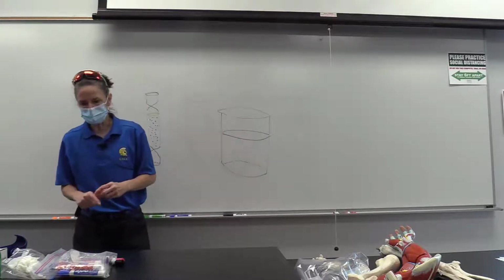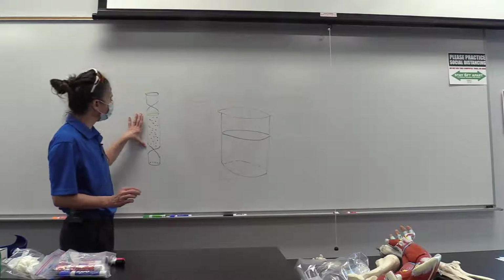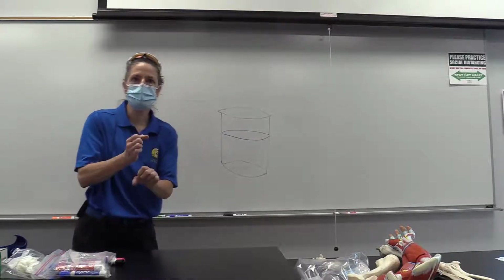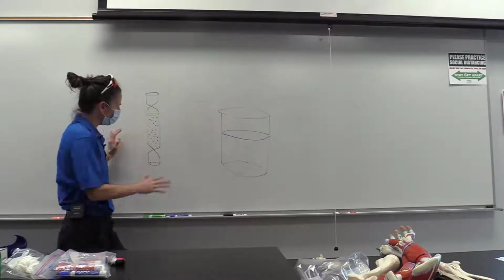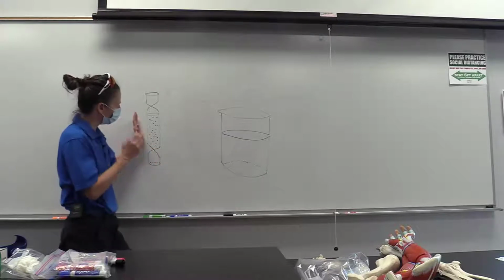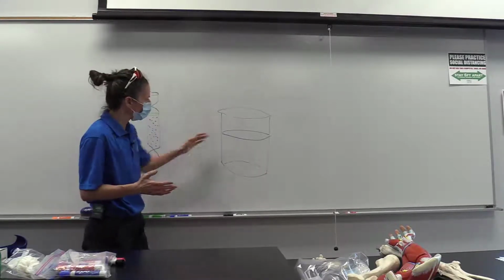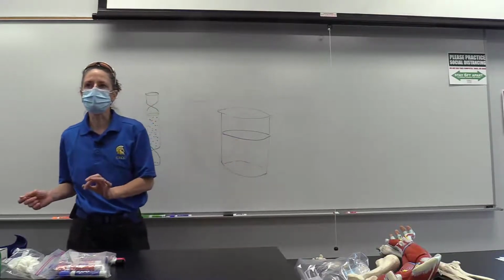And so what we did was, once we created this little dialysis tube, we got the outside of it nice and dry so that we weren't measuring things outside of the dialysis tube. So we blotted it dry once we filled it, and then we weighed it, right? Then we stuck it in the solution for an hour, right? And then we took it out and weighed it again.